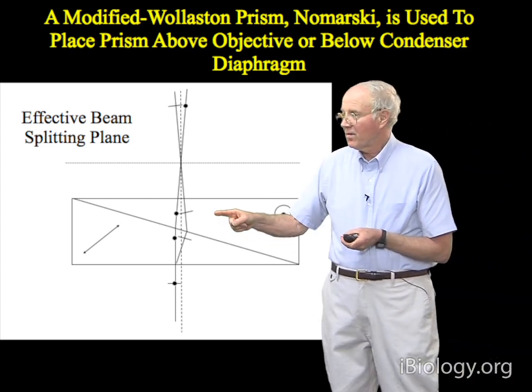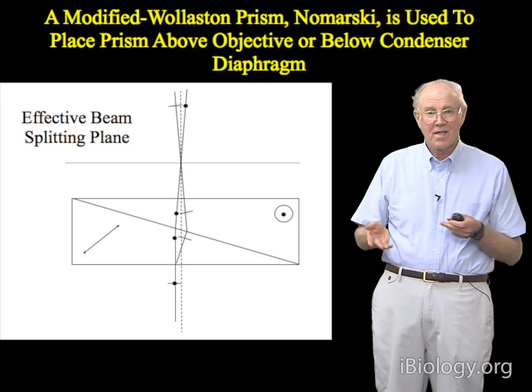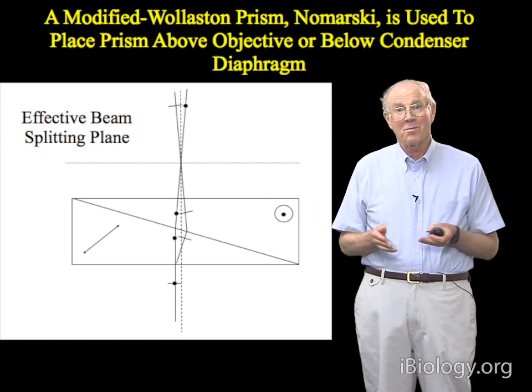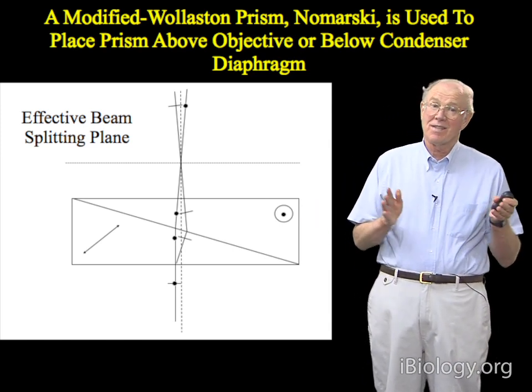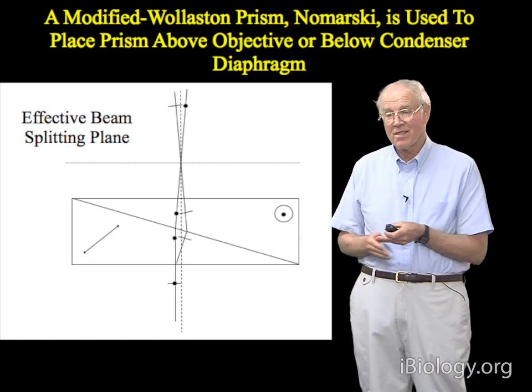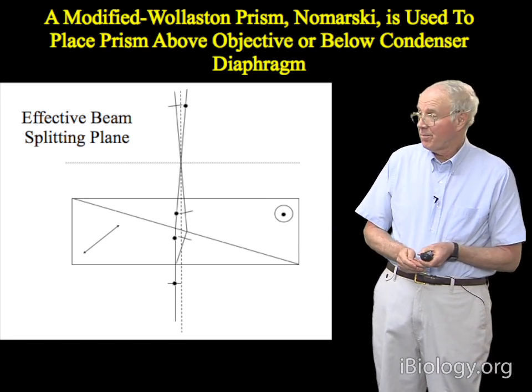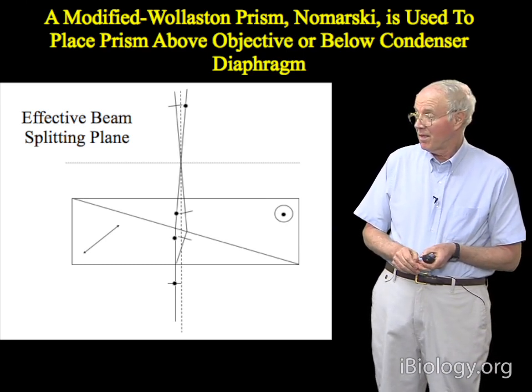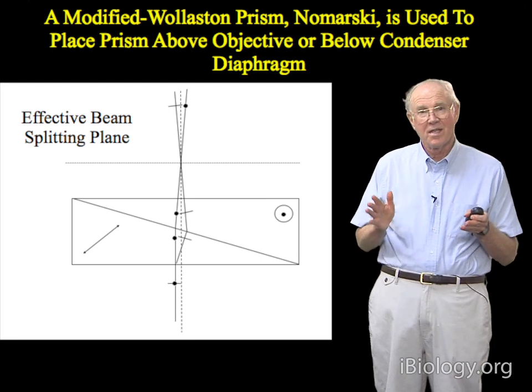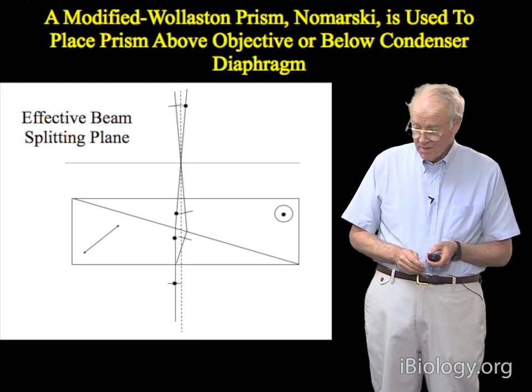Now, there are other schemes for how to build these prisms today that the different manufacturers have developed, because there are licensing problems, right? And so you can get to the same result as I diagrammed here for the basic concepts, but use slightly different prism arrangements, but the overall effect is the same effects that I've described in image formation.